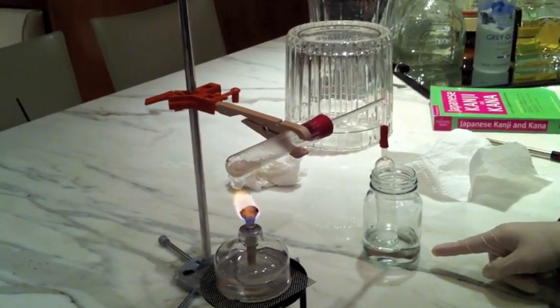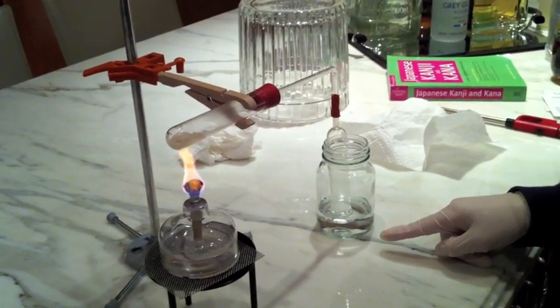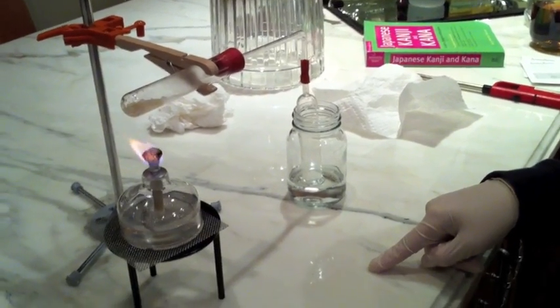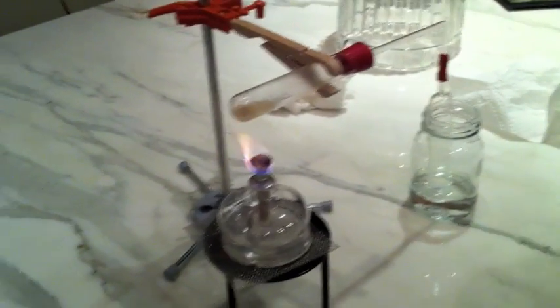We're going to see the gas. Up in there, the initial bubbles are forming here, and gradually we'll see the water drawn up into the cylinder. We'll put the inlet tube in the water. Be careful.